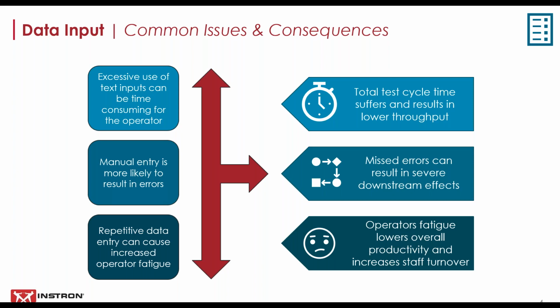Repetitive data entry can cause increased operator fatigue as well, which also has its own significant knock-on effects within the lab, causing a decrease in productivity. By reducing data entry time, the operator in turn has more value-added time to either test more specimens or work on alternative tasks. Operator fatigue can also be strongly linked to reduced morale and eventually increased employee turnover, a costly metric requiring training and onboarding resources.